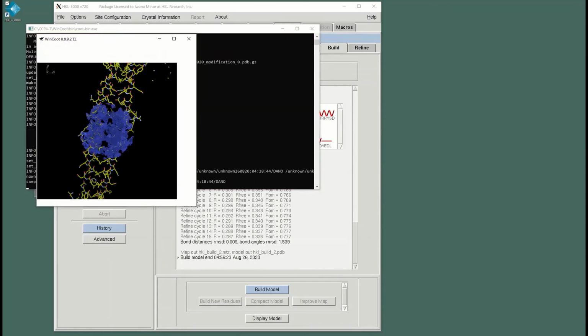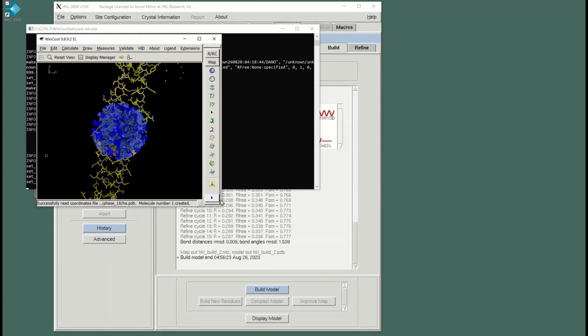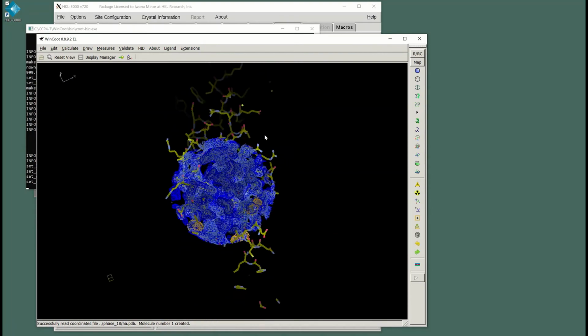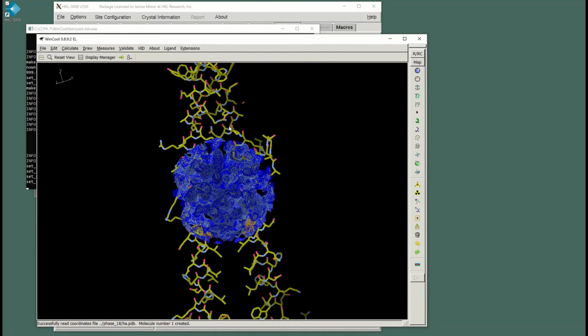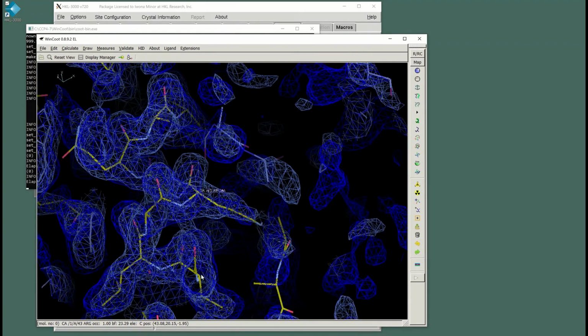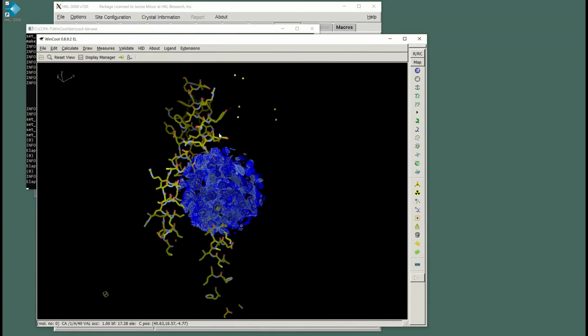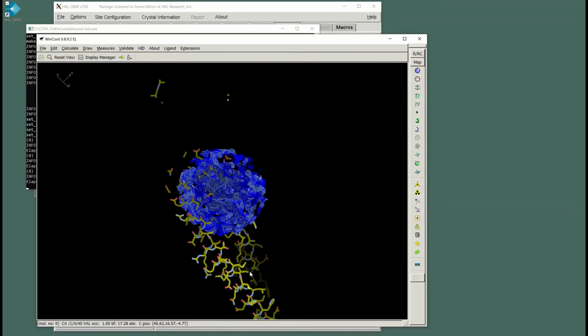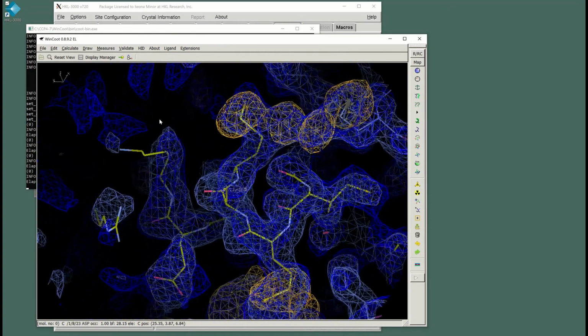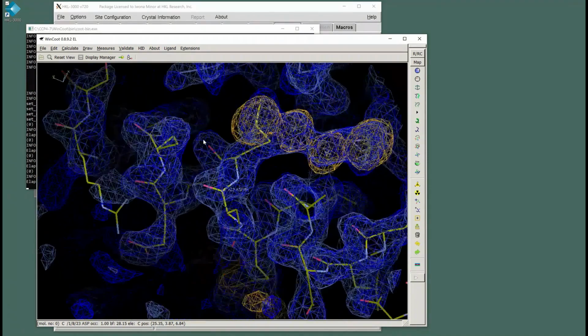In basic cases, where the initial electron density map is of high quality, you may build an almost complete model. However, when you have low resolution data, or there is some problem with phasing, the initial model will be incomplete. As with the other tabs within the Structure tab, you may modify the default parameters of the computations in the Advanced Mode dialog. For example, you may define the number of RefMac refinement cycles between building cycles.